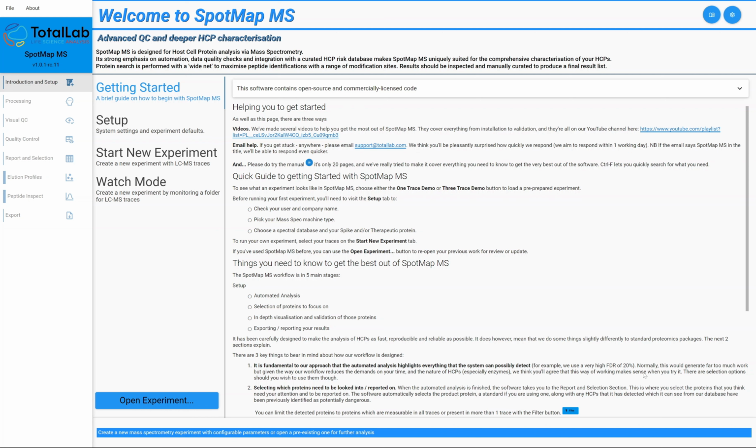And this is a question that's come up a lot when we've been showing the software to our pharma customers, the people that we work with within the pharma industry that are doing this host cell protein characterization analysis. A question that keeps coming up, or maybe a misunderstanding, is: how does your software know what to look for? How does it know what is a bad HCP? Or, how does it rank these things? How does it get its information? All questions around this sphere of knowledge.